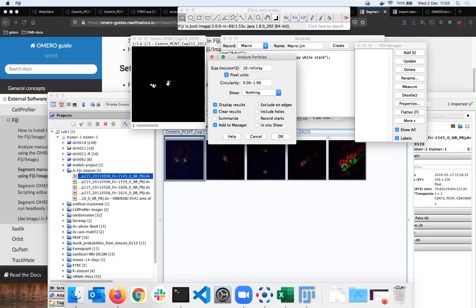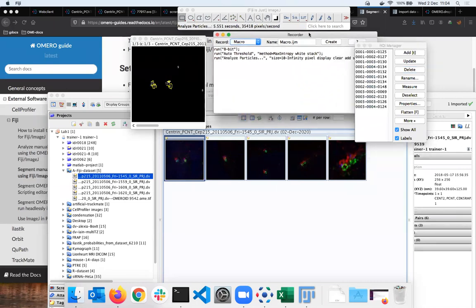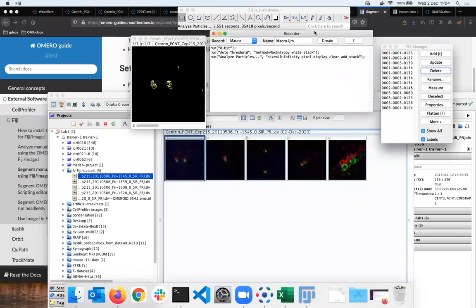By the way, of course, this is a result of painstaking work on this workflow. As you might imagine, with every image analysis you want to do something like that, because you have to tailor your workflow according to the images you are working with. And then say, okay, process all 3 images. You say yes, save one measurement which was lingering there in my table. I don't want to save that. There is another very important line added to my macro recorder.